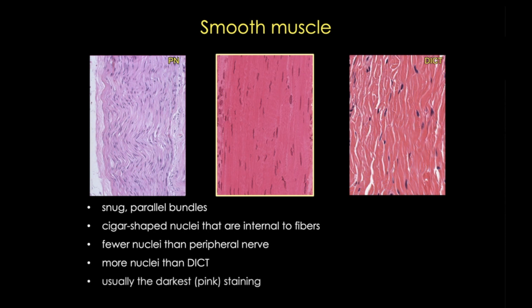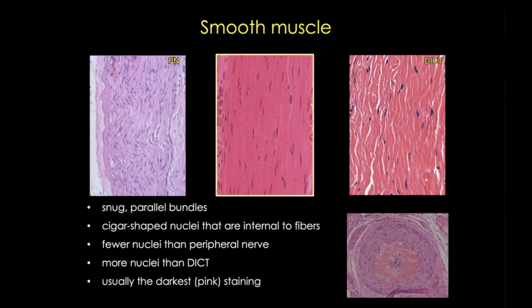Smooth muscle almost always stains more intensely than peripheral nerve. It's often, as you see here, a dark magenta pink color in an H&E stain. Now here's an exception: this is smooth muscle in the tunica media of an artery. In this case, we're looking at the location, the shape, the lack of a perineurium, and the presence of endothelial cells to provide the clues that tell us that this is smooth muscle and not peripheral nerve.